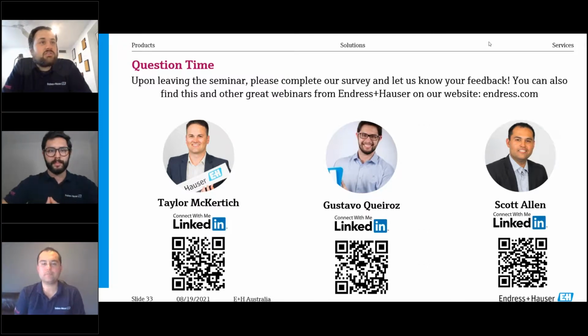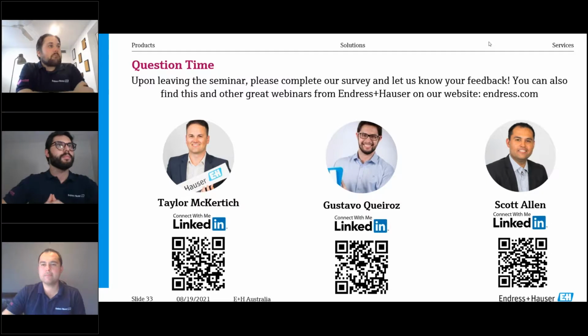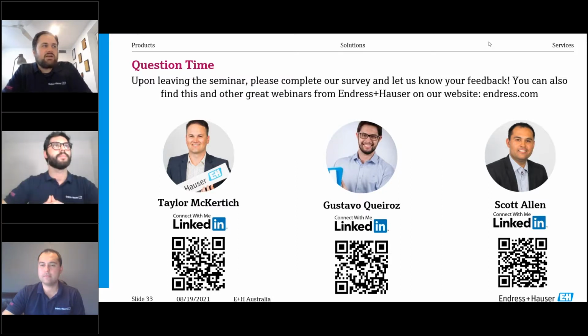All right, so I'll go straight into the questions now. We've got a question from Russell. He's just asking if there's inductive cables suited for different types of sensors. So I guess the MemoSense cable, is it okay to use between pH or conductivity sensor?